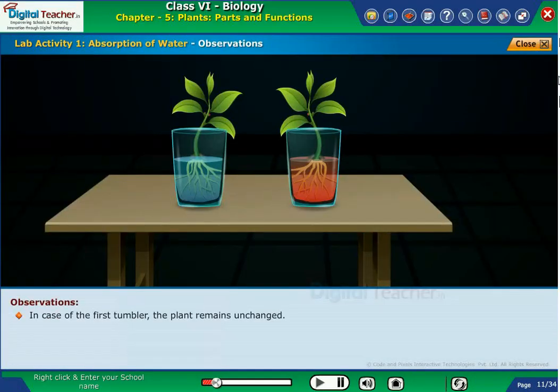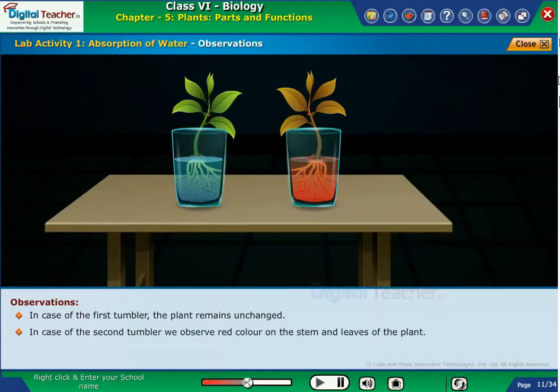In case of the first tumbler, the plant remains unchanged. In case of the second tumbler, we observe red color on the stem and leaves of the plant.